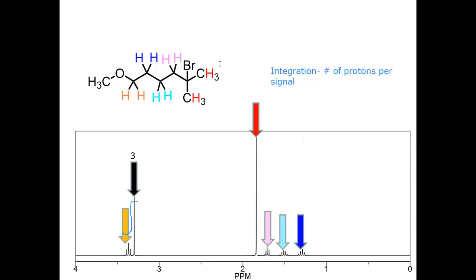If I integrated that signal, basically taking the area under the curve, sorry about that, it's raggedy looking, but you get the point. How many protons should that signal represent? Are we adding them? Yes, so it'd be 6. You add them together. So the integration for this signal is going to be 6. Can you see now why this is double the height of this?